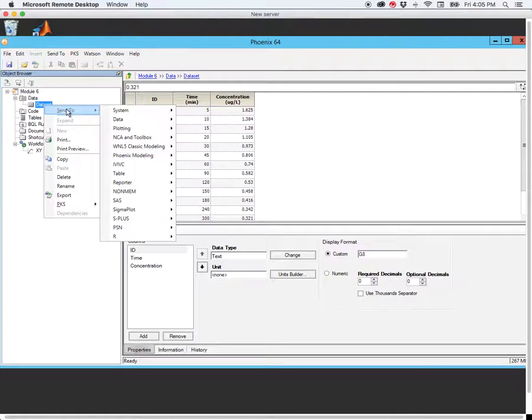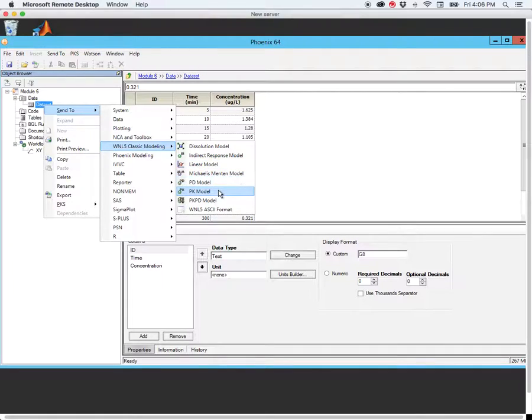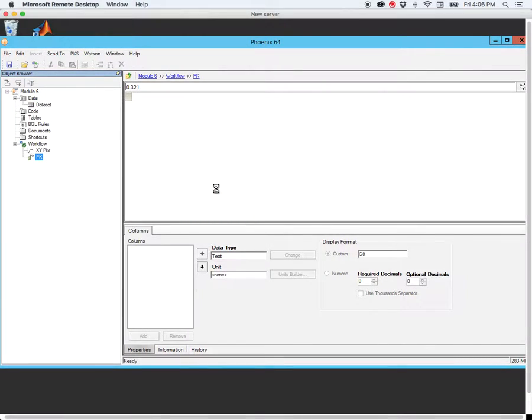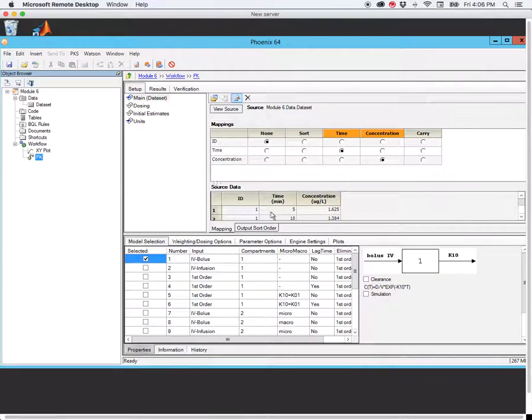Our next step, once we've plotted, is to send this data to WinNonLin Classic Modeling, choosing a PK model, so that we can start looking at whether we can fit a PK model to these data. We choose PK model. We know that these data were generated by giving the drug as an IV bolus to this animal, so we are limited to the IV bolus models.